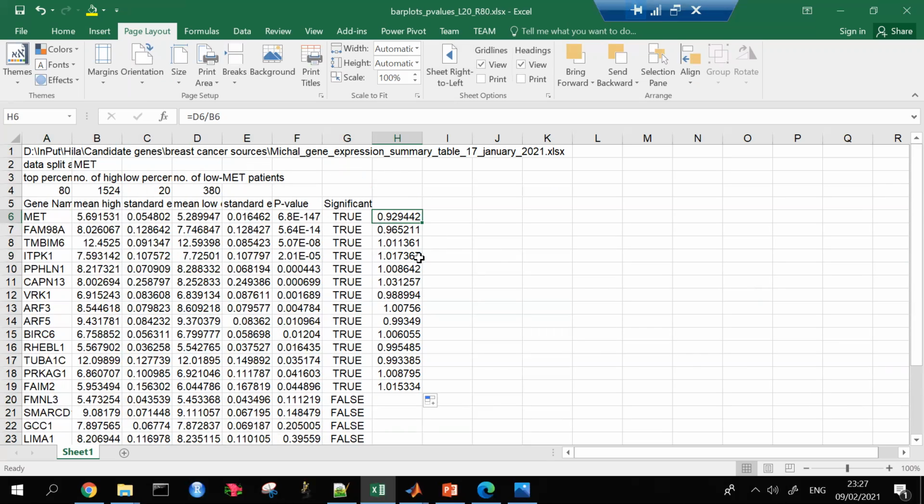But you have to be careful with that, because you have to look at your data beforehand, and if you have, for example, normalized data with values surrounding 0, and you have negative values, then a division wouldn't really represent the fold change of the data.